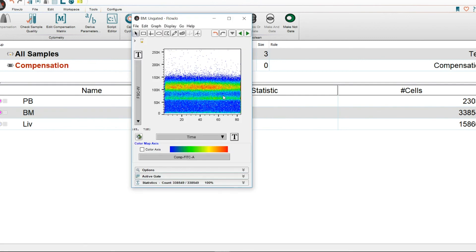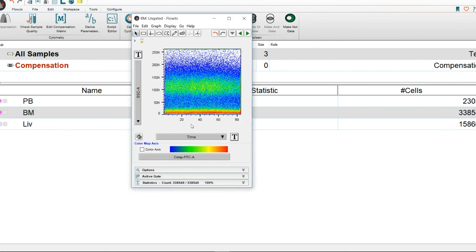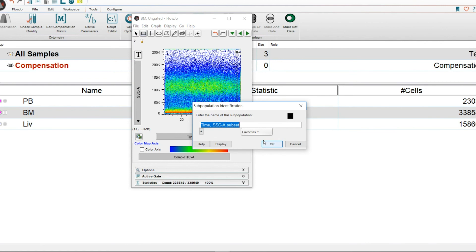So we would go back, open our window, and then let's do side scatter area, and we could see that there is a problem over here at the end. So the way we could do this is we go ahead and select it, create a gate around it. Let's call this our time gate.